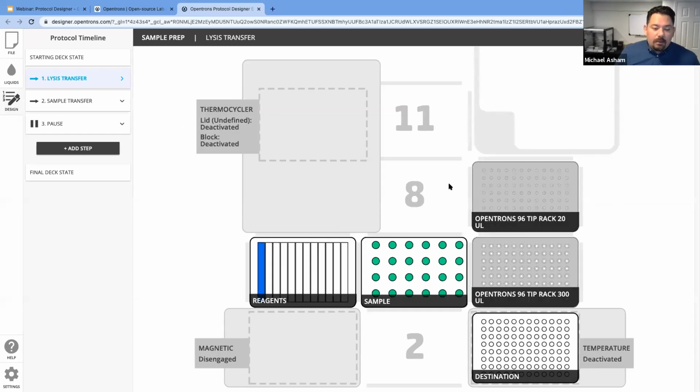Thank you for that. Next question is, can we prime the tip? Basically, the term I think you're used to is condition the tip before transferring a desired volume. Viscous samples may stick to the pipette tip if we do a single draw and release. So this is more liquid class centric. And for all liquid class related questions, I would encourage our audience to watch we had a very specific liquid class webinar. But Catherine, I think you're more than apt to handle this as well.